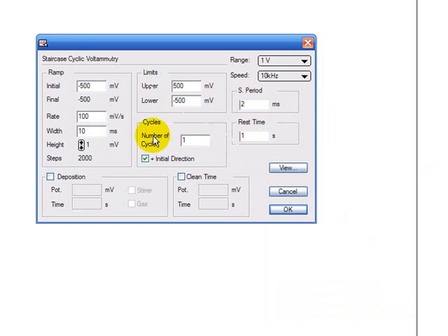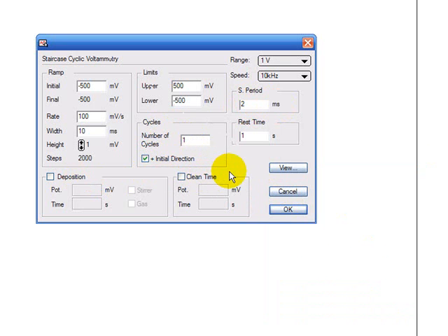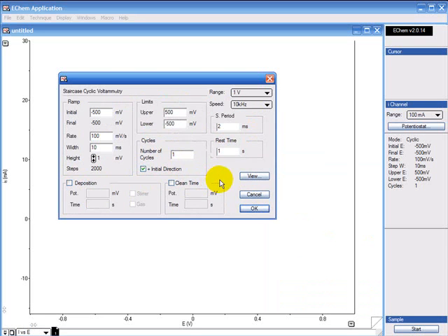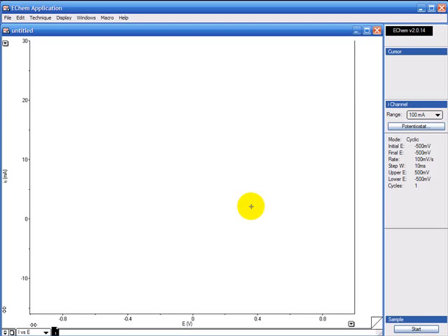You enter the number of cycles. I'm going to start off with just one cycle. The deposition and clean time are not normally used. They allow you to apply a fixed potential. When you're ready to run, you click OK.